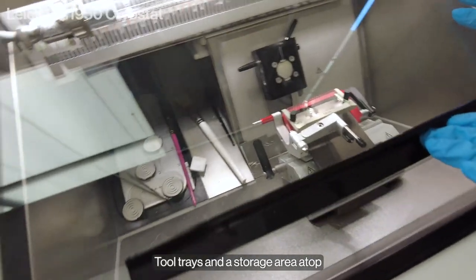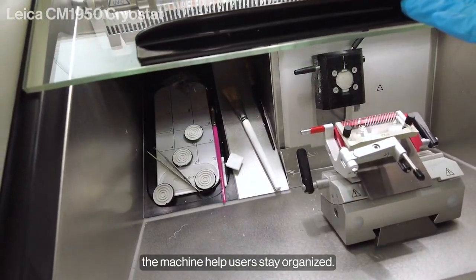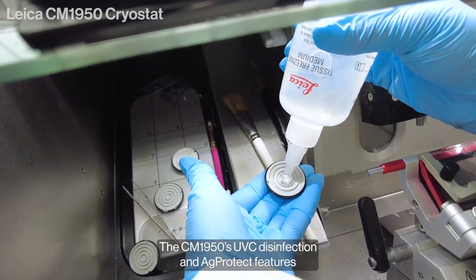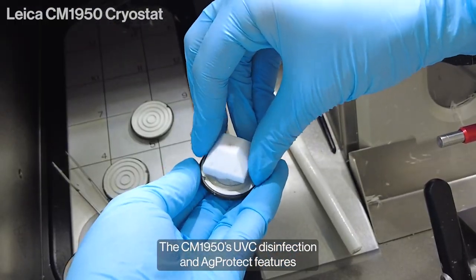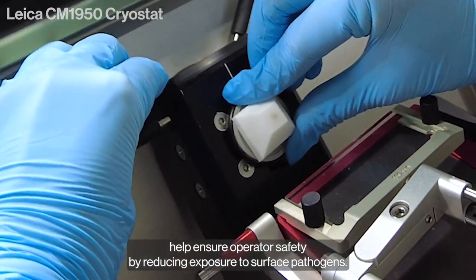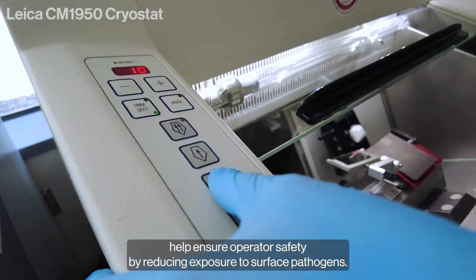Tool trays and a storage area atop the machine help users stay organized. The CM1950's UVC Disinfection and AgProtect features help ensure operator safety by reducing exposure to surface pathogens.